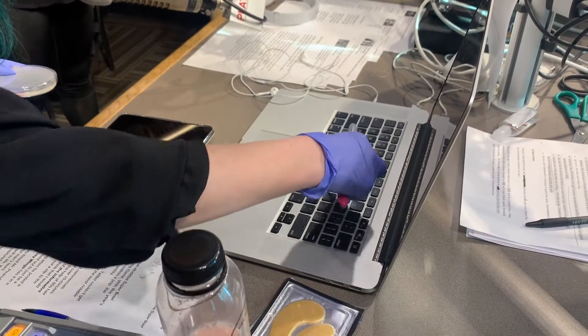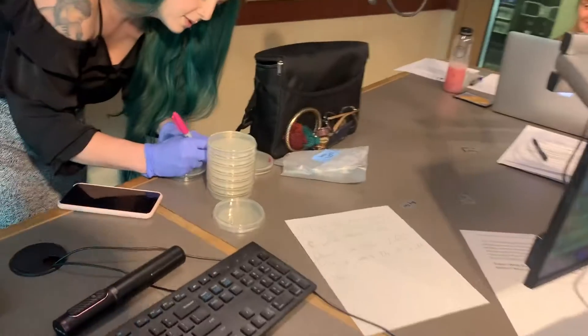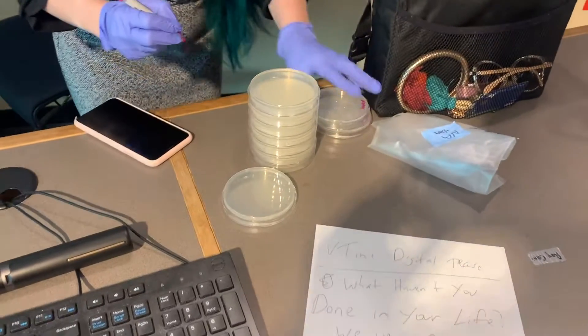Oh man, let me tell you, I'm so nervous. She has a petri dish, which I'm sure is going to be infested with all things Roy here in the next 48 hours.